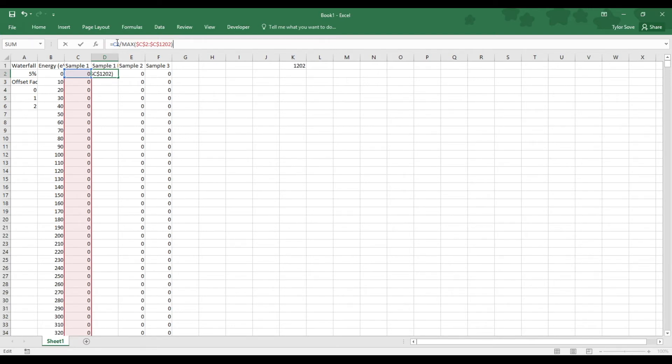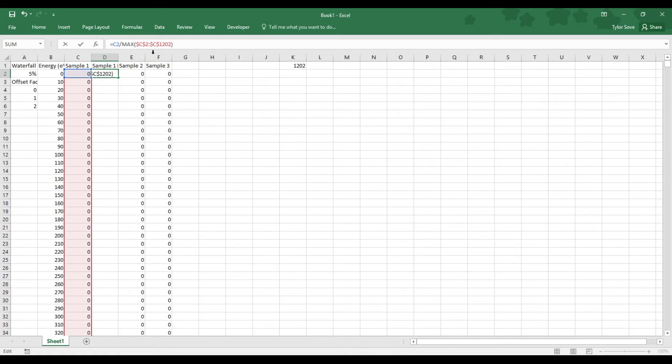Now when I extend this code to the remainder of this column, this front portion over here, C2, will change to C3, C4, C5, and so on and so forth as it goes down. So now this is done with the normalizing.